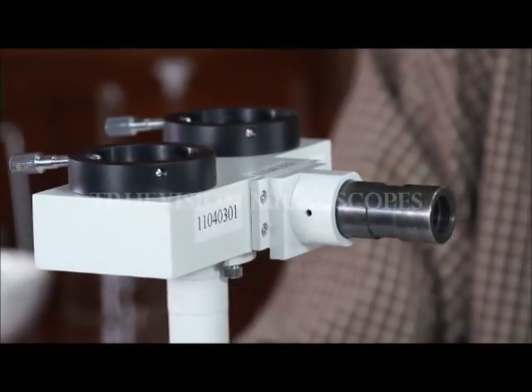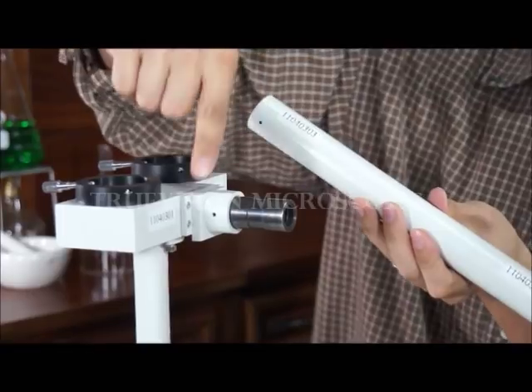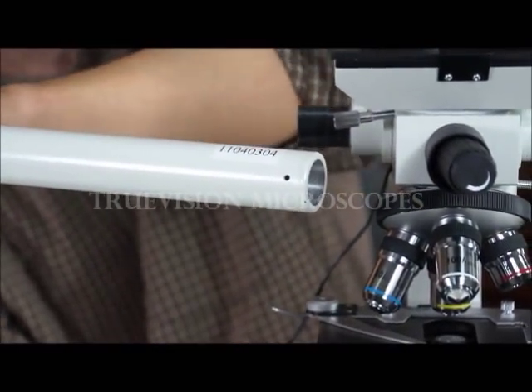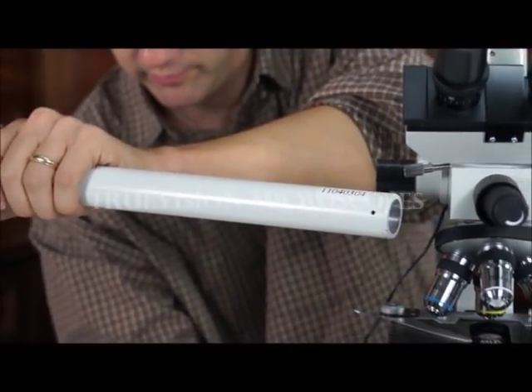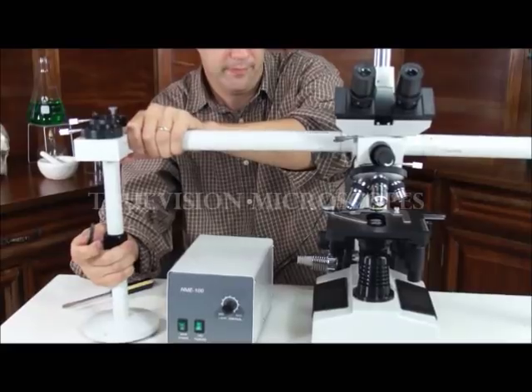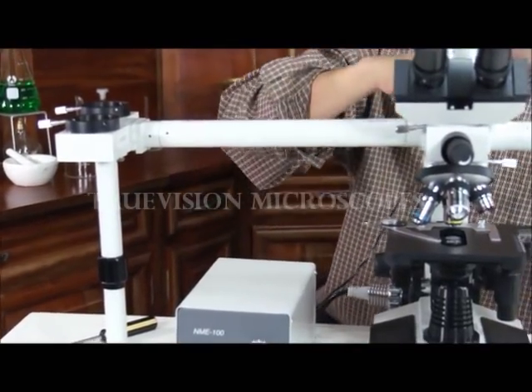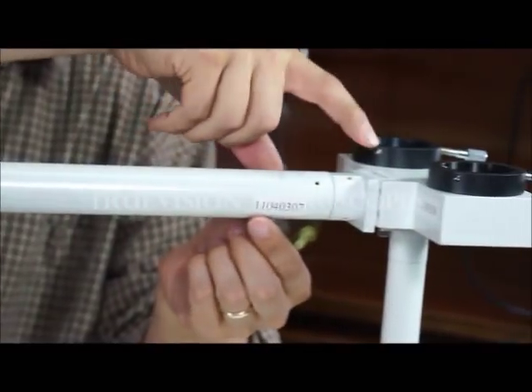The microscope is all labeled. This number matches the number that's over here. Also, this number matches this number. In order to get this into place, I'm going to have to remove this bottom screw so I can scoot it over, then put this screw up from the bottom to lock everything into place. Same thing on this side — we have a sticker with a number and it matches the number here. Another sticker matching this number.